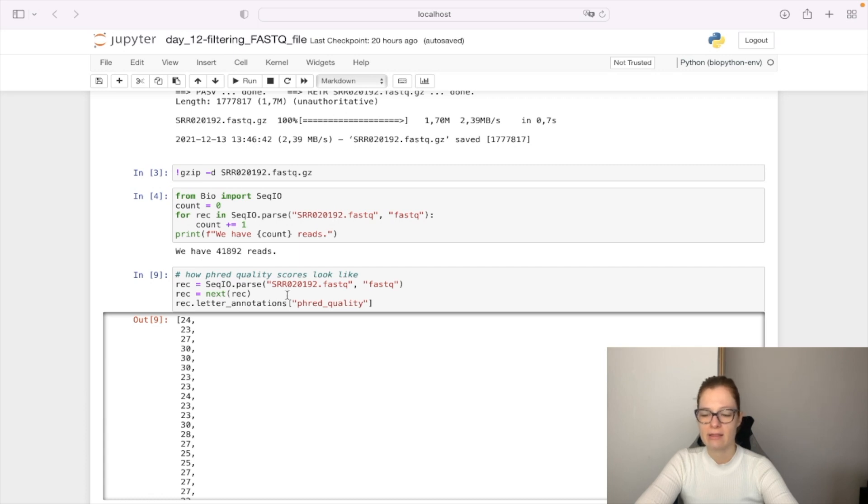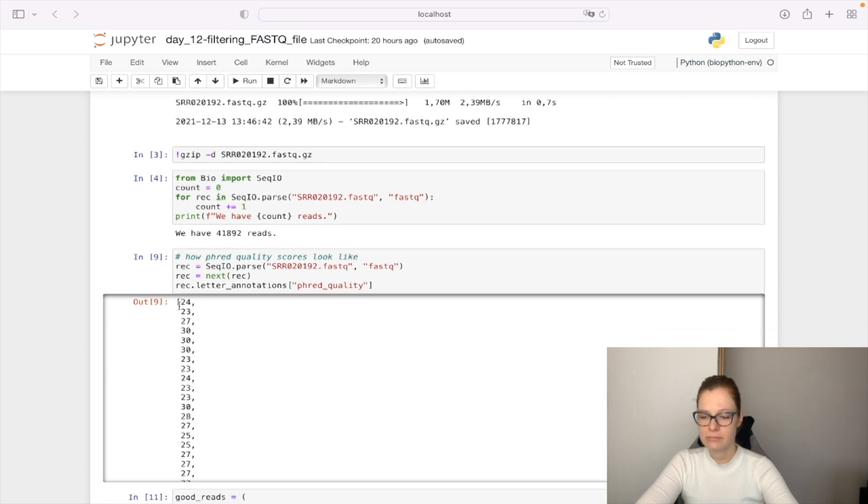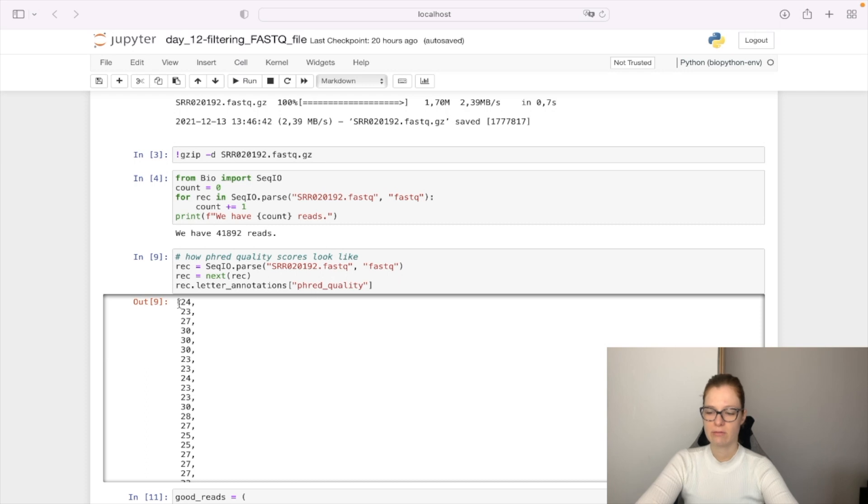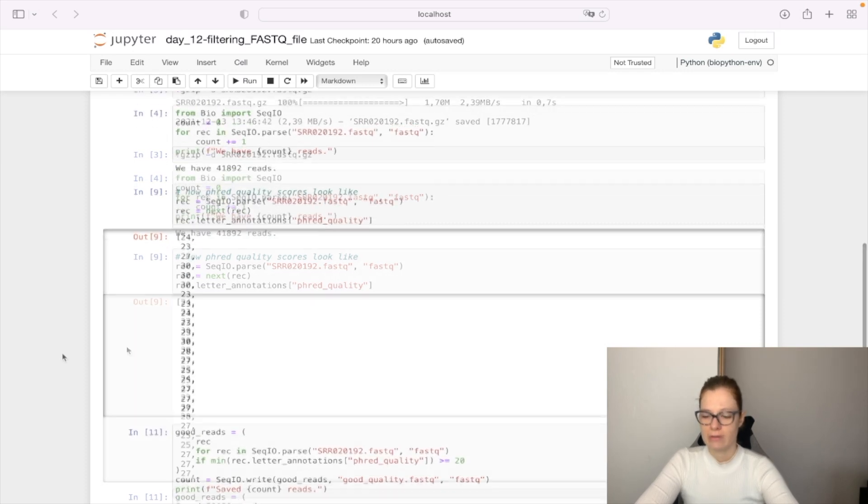We access the Phred quality scores by accessing the key 'phred_quality', and this gives us back a list of Phred quality scores per nucleotide.